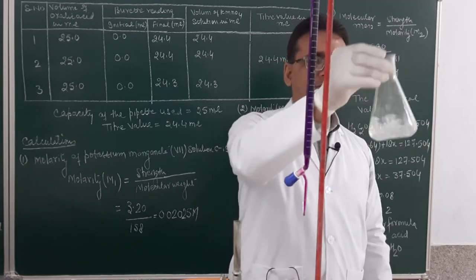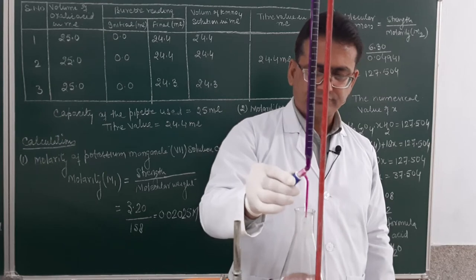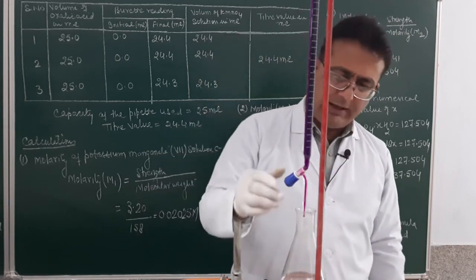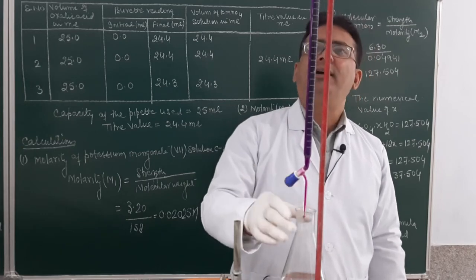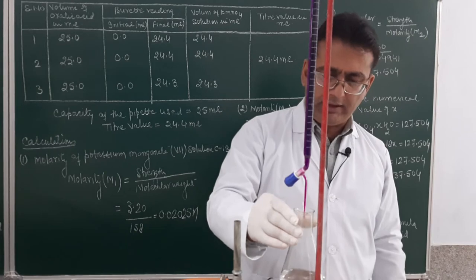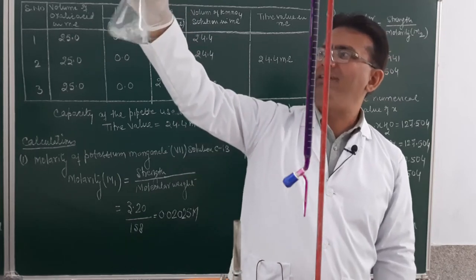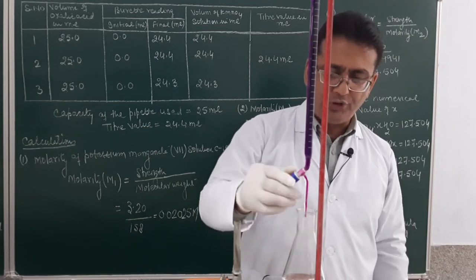You may see over here, still a few more drops are required. We are almost there, so I'll add a few more drops to obtain the persistent light pink color of the solution. You may see, although it seems to be getting pink, when I shake, it still disappears. So a few more drops.